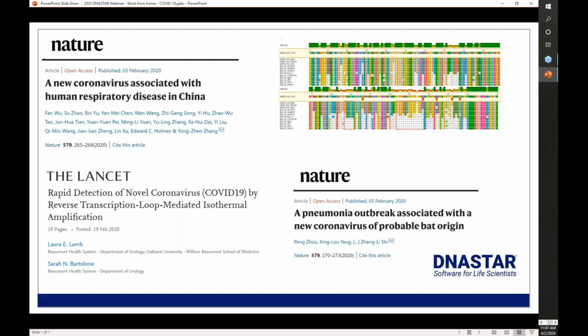Because of the current pandemic, we thought it would be very helpful to put together a quick webinar to discuss some tools that researchers might not be aware of in the suite. For example, we probably have all types of users here in the webinar today. We might have new users, we might have longtime users, we might have individuals that simply came to our website and are working with a demo.